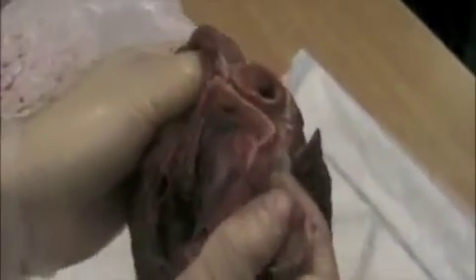But if we go up to the aorta and take a look at that, we should be able to see more in the way of properly preserved valve. And I'm lucky there, look, because I've just cut it in the right place. But you can see the sort of bag-like quality that I was talking about before. If I just put my scissors in there, look how delicate that is. I mean, just look. That's going to resist 120 millimetres, 80 millimetres of mercury, pressure per beat. It doesn't look as thick as cling film.